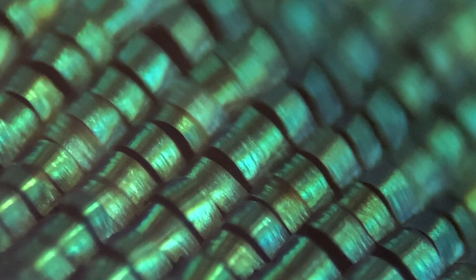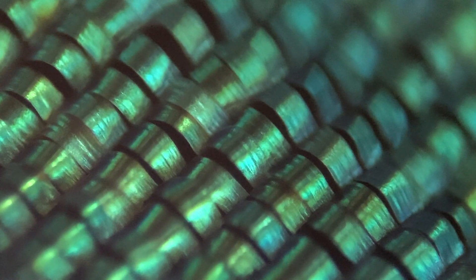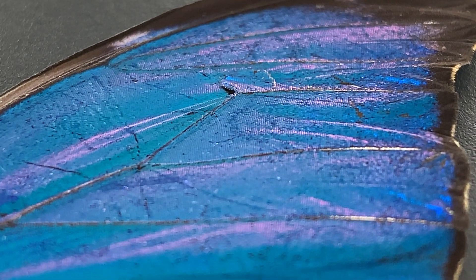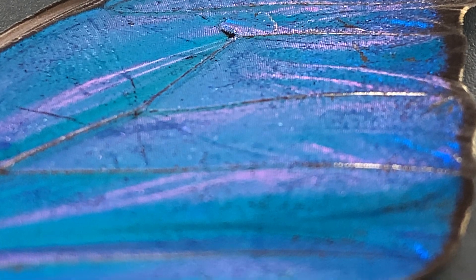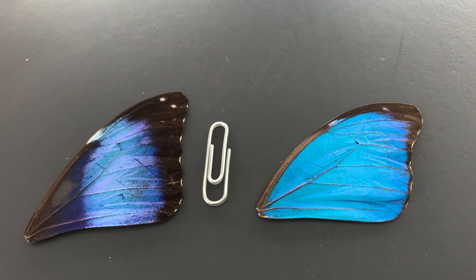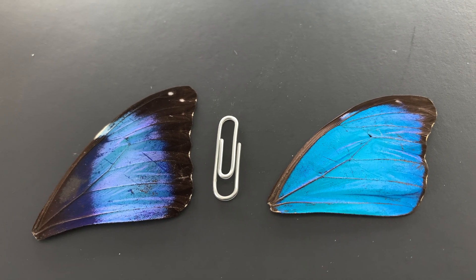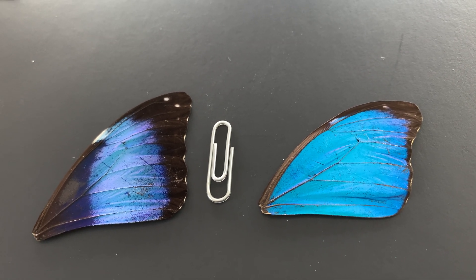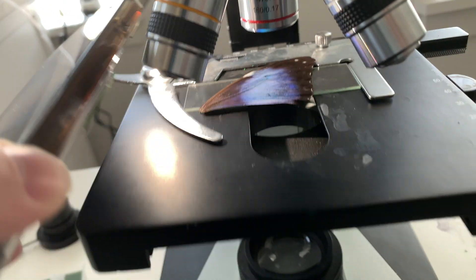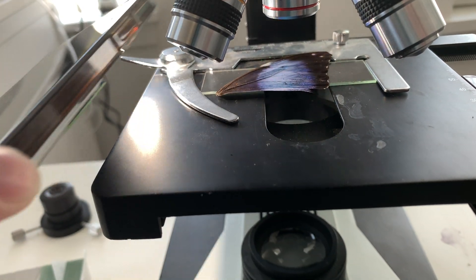My wife said they look kind of like curlers. Now, this one is a blue morpho butterfly — it's really, really popular, but also kind of expensive if you want to buy the whole thing all intact. Here's kind of like a size comparison, and then here's what it looks like right under the microscope. It's pretty big.